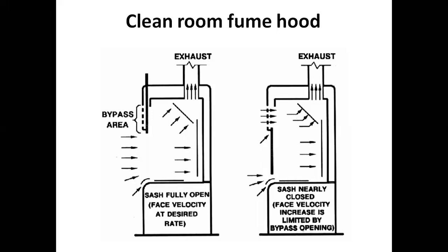So you have to do those processes or fabrication inside the fume hood. In the fume hood, we would have a blower which sucks the air from the clean room, and that air is exhausted outside the clean room through the chimney, etc.